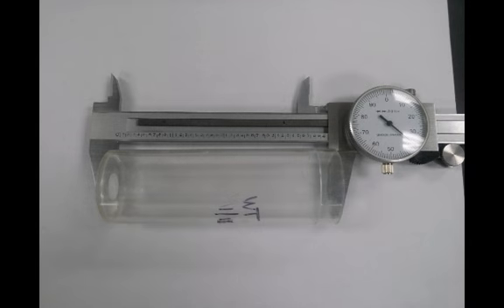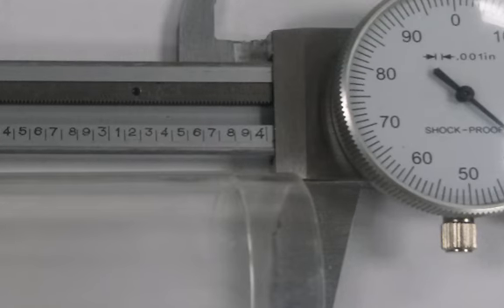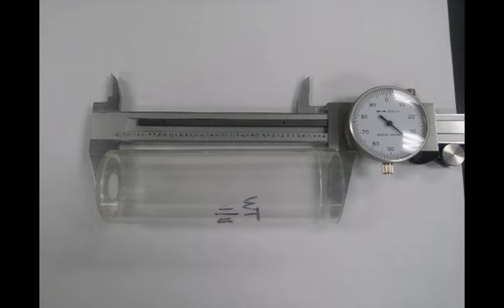Let's go back to the culture vial, but this time, rather than using a ruler or a meter stick to measure the height of that culture vial, let's use the calipers. I've positioned the calipers in such a way that I can measure the height of the culture vial. If we zoom in on the calipers, we're going to see that the numbers on the metal piece of the caliper are giving me a measurement that's just a little bit less than 4.1 inches. But how close to 4.1 inches are the calipers measuring the height of the culture vial?